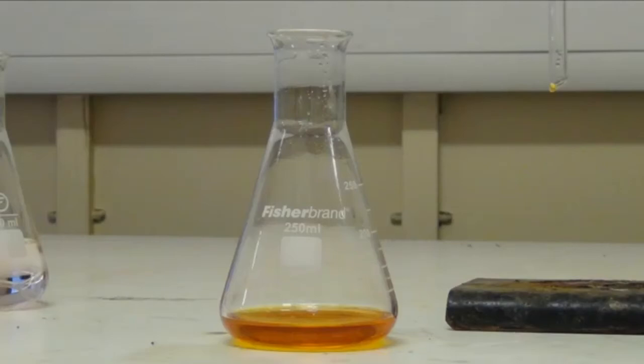However, you often need to still remove some more impurities, so it is common for this to be followed by distillation or recrystallization.